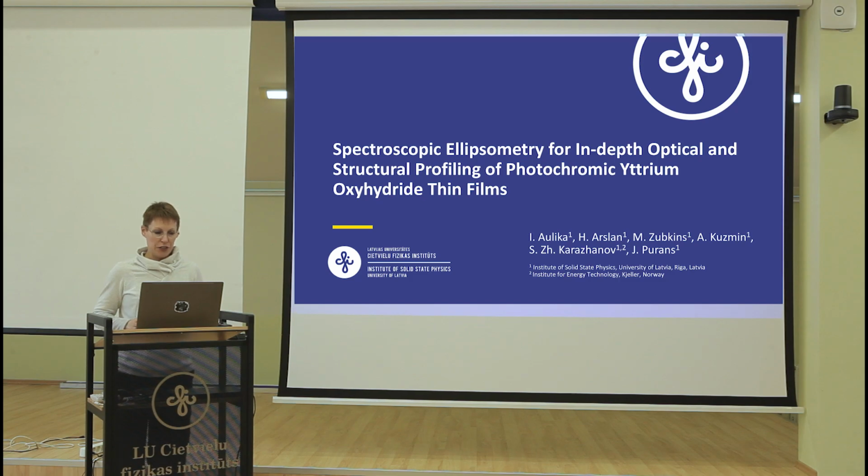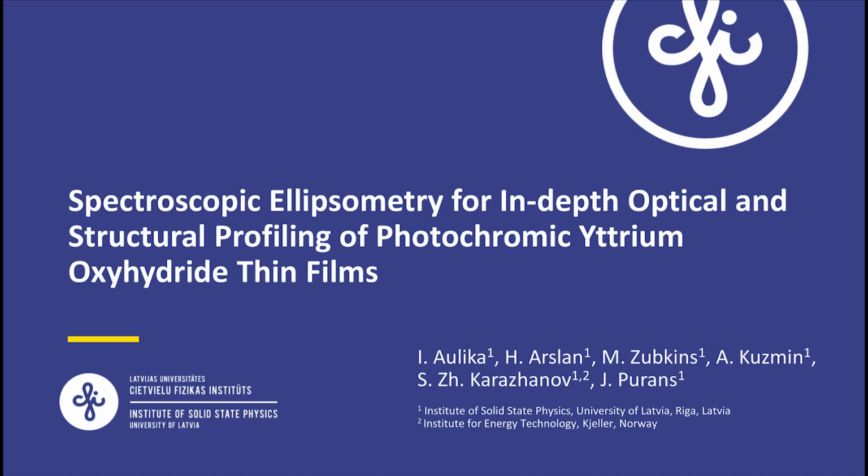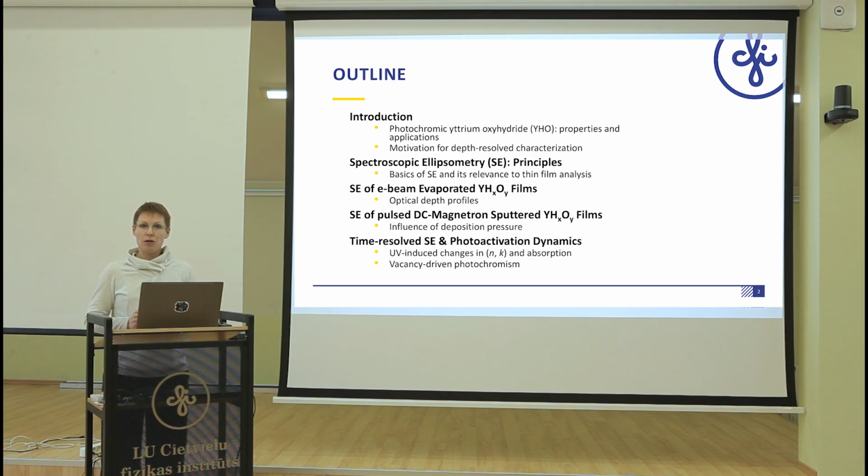I'm glad to present you spectroscopic ellipsometry for in-depth optical and structural profiling of photochromic yttrium oxyhydrides in films. This is the outline of my talk.